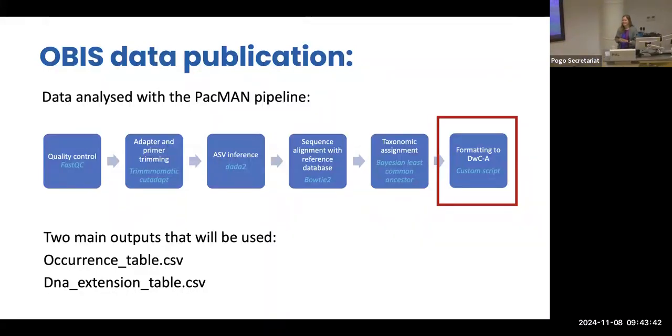And then, so we actually do taxonomic assignment with RDP and with vSearch as well. So we get those vSearch identities for our references, and we get that reference sequence from the NCBI or whatever your reference IDs are. And we will do a blast as well. So we have kind of multiple different annotations, and then we try to figure out what it actually is.